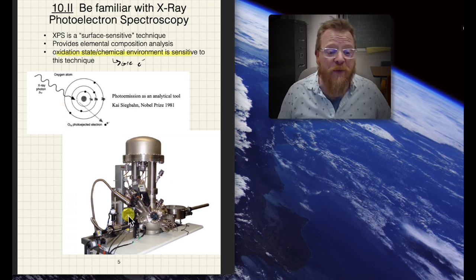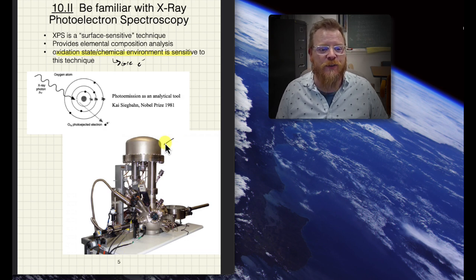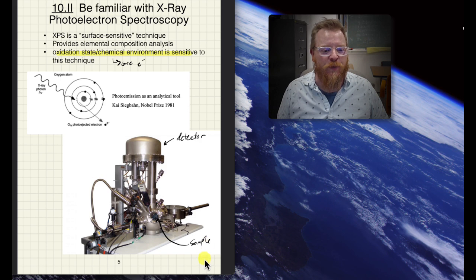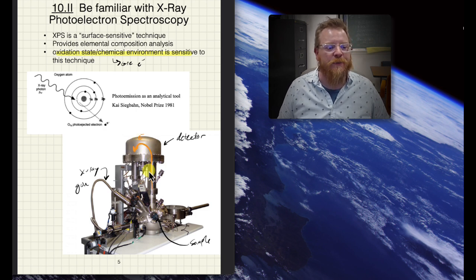So this is a picture of what an XPS might look like. As noted, it is complicated. This is what's known as our hemispherical energy analyzer. I'm just going to approximate that and say this is our detector. Our sample would be located in this vacuum chamber right here, and this is our X-ray gun. X-rays are bombarded on the sample, and photoelectrons are ejected up into this hemispherical energy analyzer. So the electrons come through and are analyzed here.